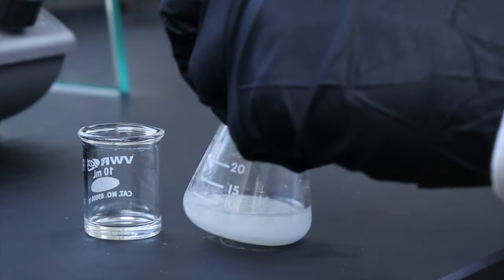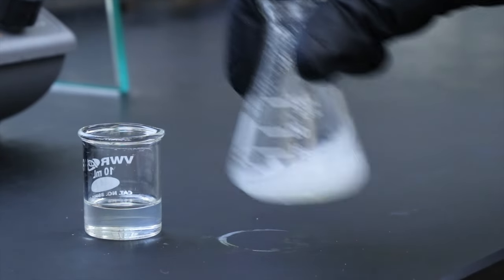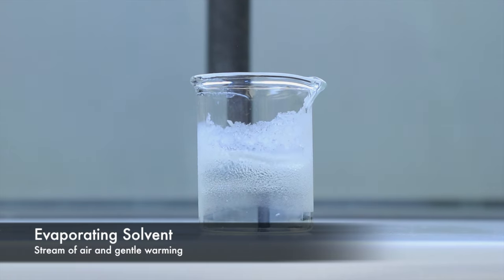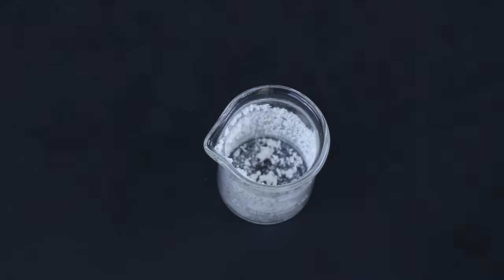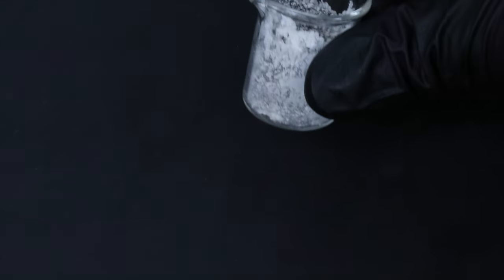Once I've removed the dry methylene chloride solution, I'll actually add a little bit more and rinse the sodium sulfate to reclaim any alcohol product that might have been left behind. Now I can just evaporate off the solvent, and you can actually start to see the alcohol product gathering on the side of the beaker here. But this is what the crude product looks like once I've evaporated off all of the methylene chloride.